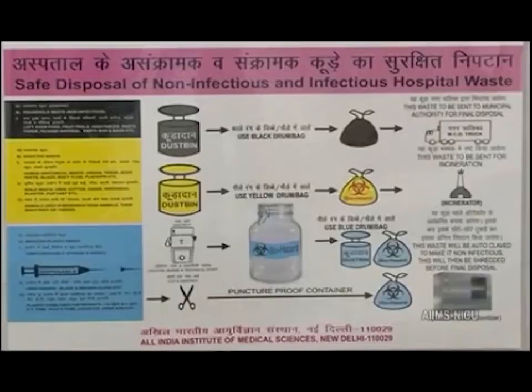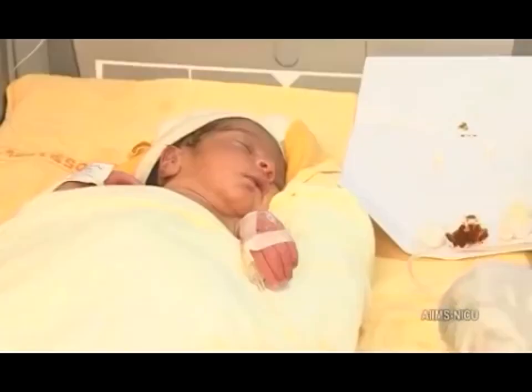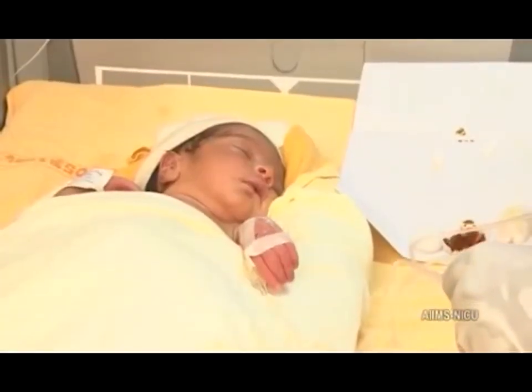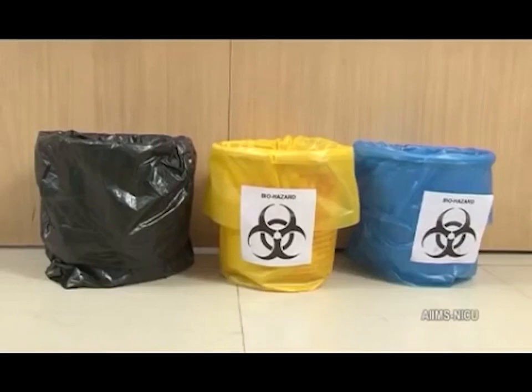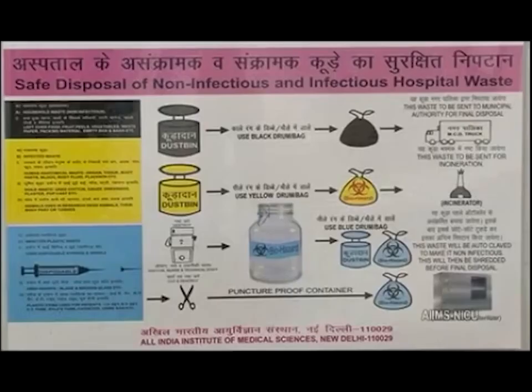Proper disposal of waste is important to protect the healthcare workers and the patients, and to keep our environment clean.